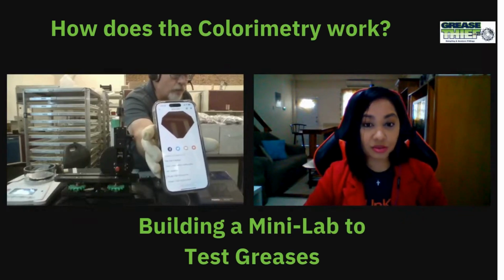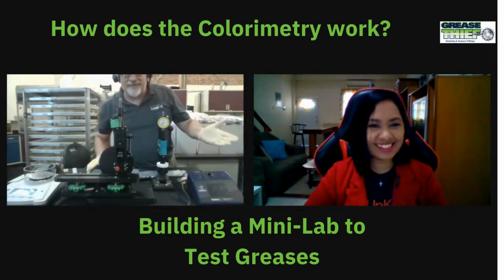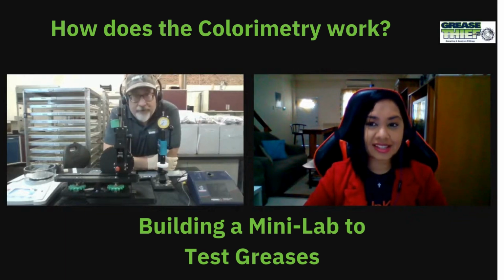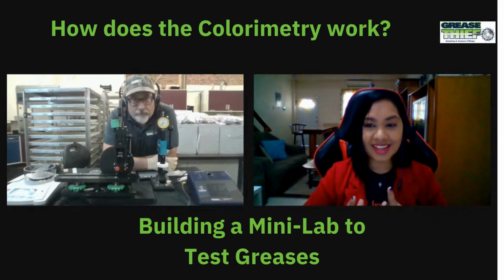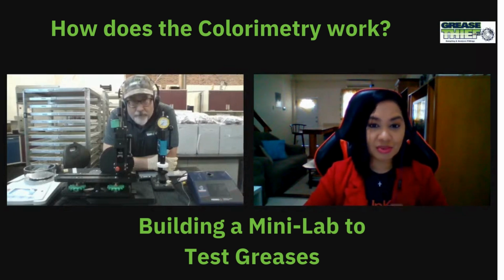values, and we're going to work with those CIE values. Does that ring a bell? Oh, of course, CIE. Tell us what that is. It's all about the color, all about different intensities of the color. And this is linked back to a scientific chart, so it's not like we're just making up different colors. That is what standardizes it. That's what gives us what we want to look at and what we want to work with. So that is an important one.